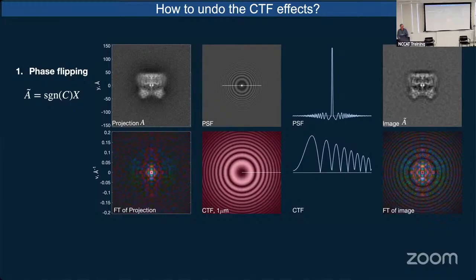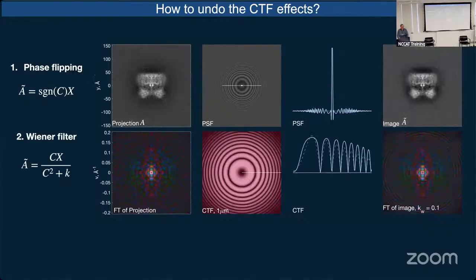And that would allow you to use smaller boxes because you're cutting off less information from dispersion, from delocalization. Now, the other thing you can do is there's something called the Wiener filter, named after Norbert Wiener, who said, well, you can do this deconvolution if you multiply the numerator by the contrast transfer function, but put the contrast transfer function squared in the denominator, and then you put in some kind of regularization constant that keeps the thing from blowing up at zeros of the CTF.